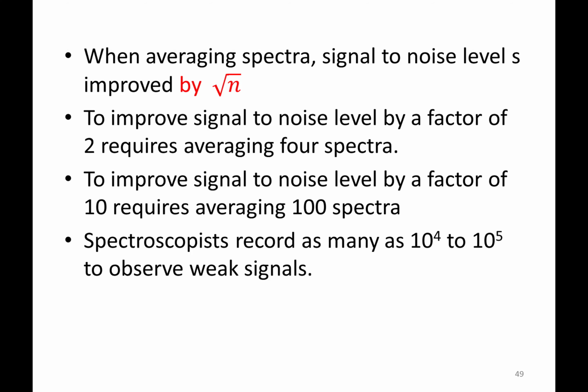To improve the signal-to-noise ratio by a factor of 10, you need to take 100 spectra. Are we together there? So the same thing. If you have 4 spectra, you square that number, you need to get 16 spectra.